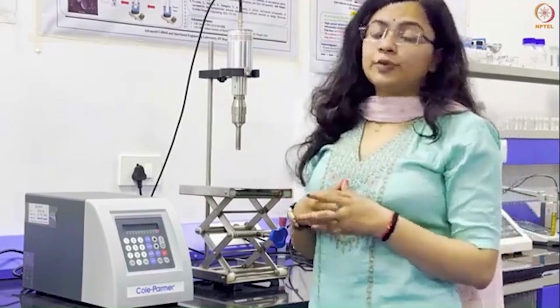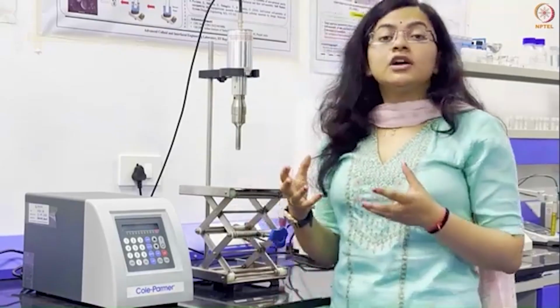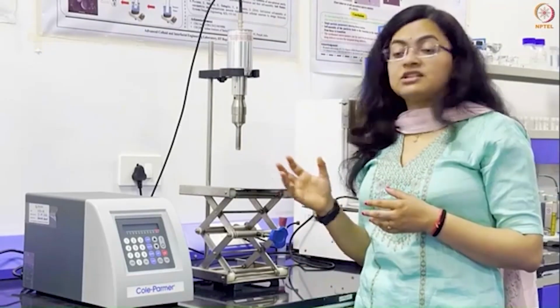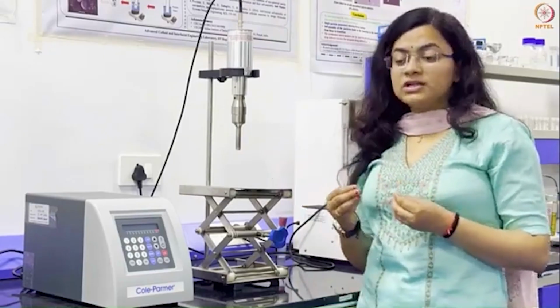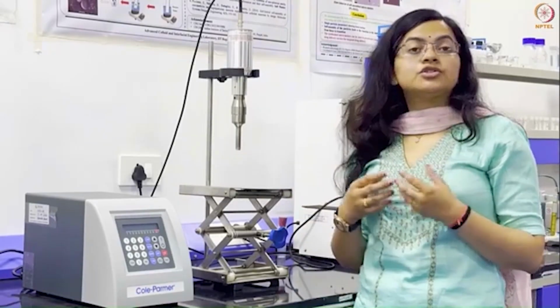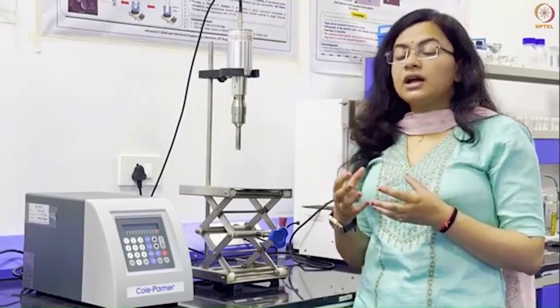So this probe sonicator utilizes high-frequency ultrasonic sound waves, creating vacuum bubbles in the solution. And during this cavitation process, these bubbles form and collapse, releasing energy through shock waves into the system. And then this energy weakens molecular bonds, allowing particles in the solution to disperse and mix effectively.